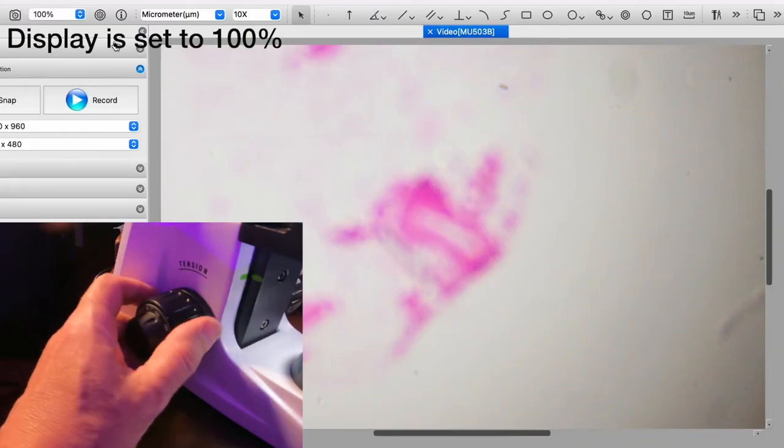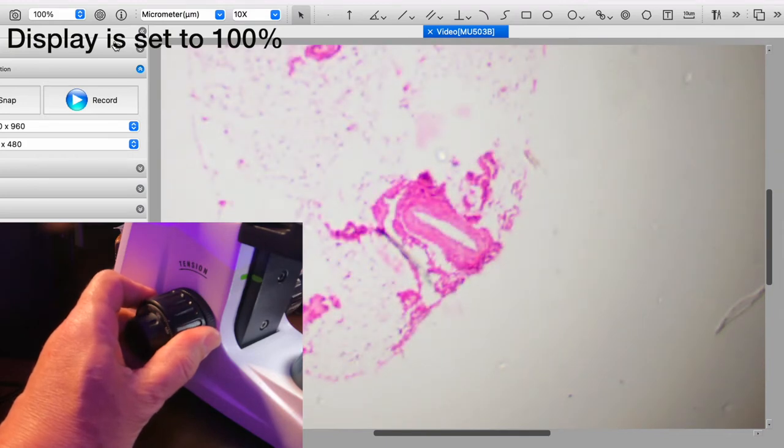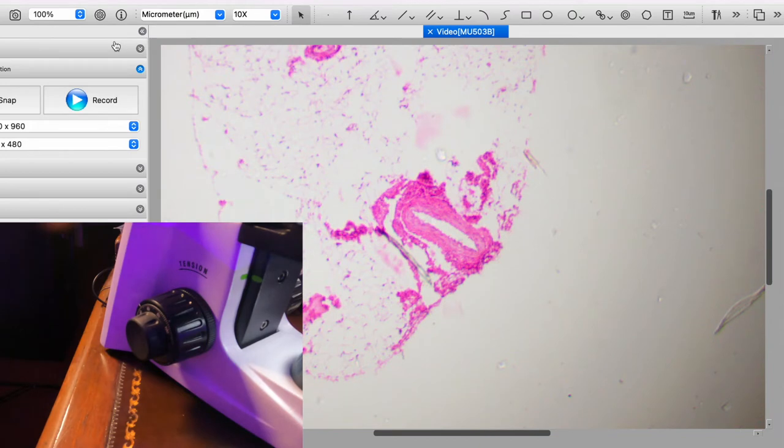Here I've got one of my favorite slides. It's of an artery. It tends to show the clarity of the lenses very well. So the first thing I'll do is bring the object into focus using the coarse adjustment, and then I can make fine adjustments with the fine focus. Okay, so that's generally in focus.